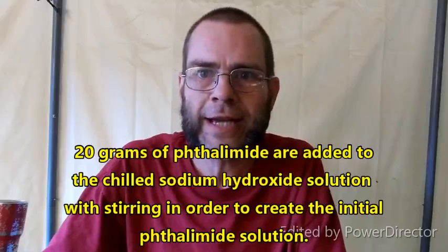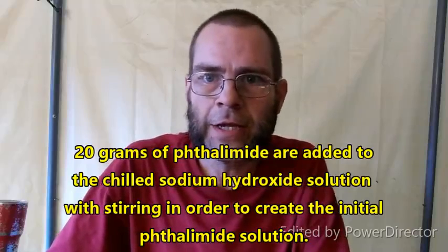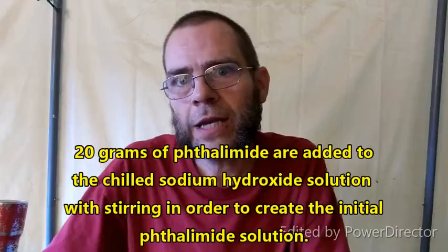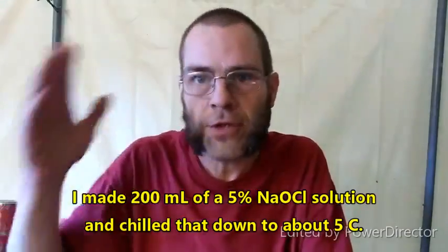So, anyway, with this particular synthesis, since I cut it all in half, it started out with creating a solution of 40 grams of sodium hydroxide in 140 milliliters of water, and then chilling that down to about 10 degrees Celsius before adding the phthalimide to dissolve it. At the same time, the 5% sodium hypochlorite solution that I was going to use to actually do the reaction was also cooling. That's really all that you're missing from me starting from the clips that I have.